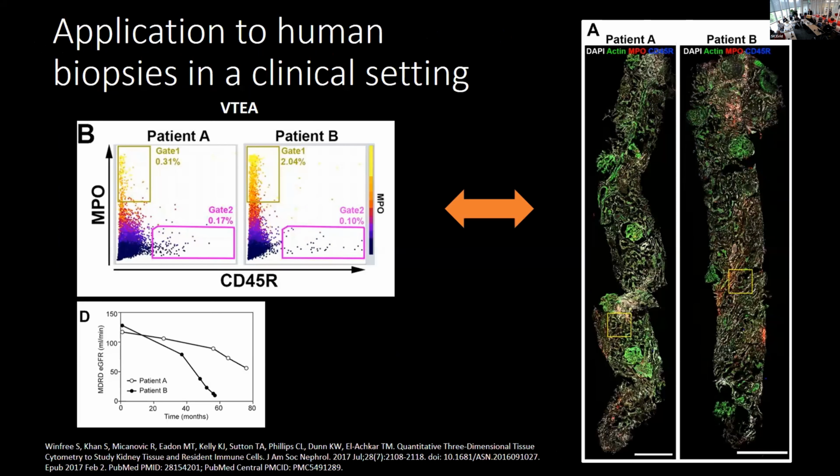So this is a basic approach that we've applied to a number of cases. This was in the initial publication, where we just correlate the degree of infiltrates with clinical outcome, or well, clinical markers, I'll say. This again was just these two particular patients, so I wouldn't draw any specific conclusions from it, but it shows that we can and could have the possibility of associating cytometric measures to clinical measures.